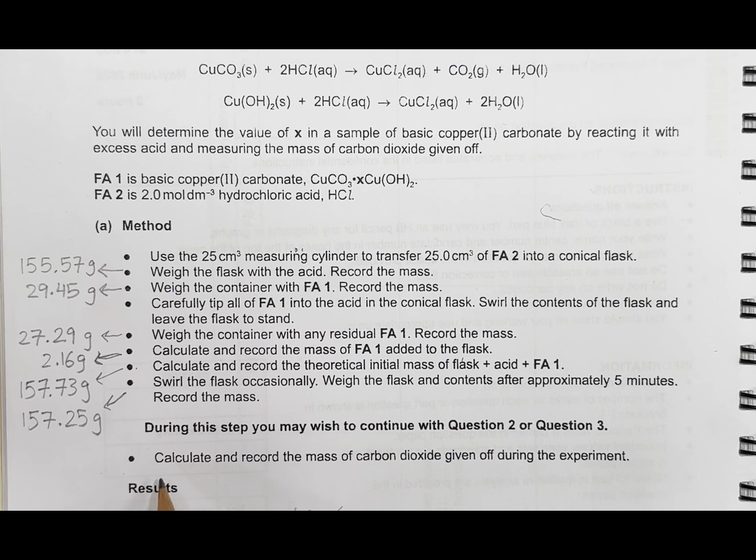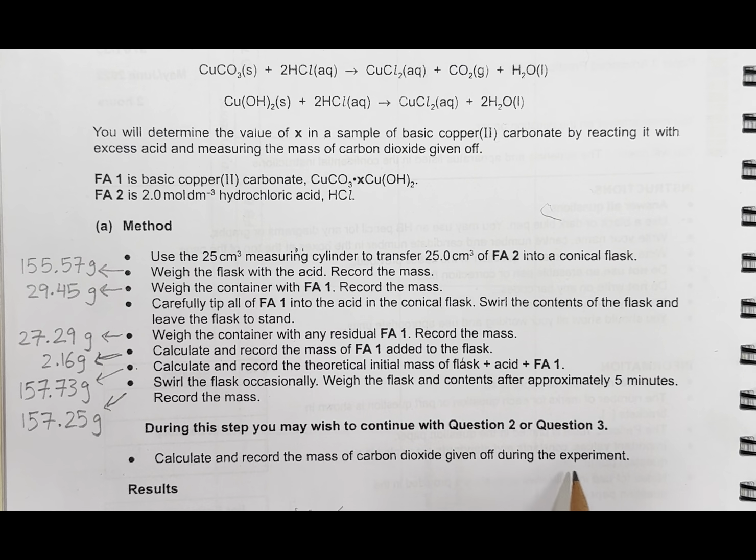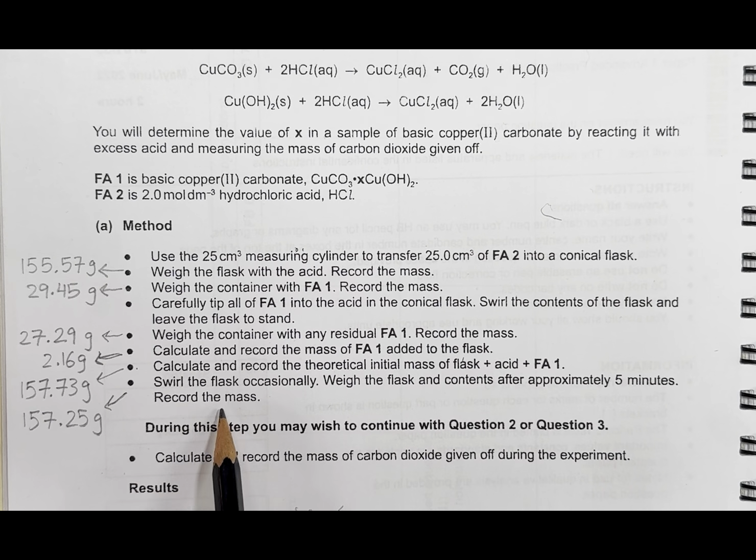The next part says calculate and record the mass of carbon dioxide given off during the experiment. It means firstly we have recorded the theoretical initial mass of the flask, acid and Fa1, and then we have recorded the mass of the flask, any residual acid and the Fa1 consumed after 5 minutes.